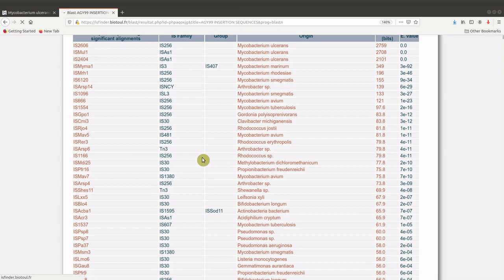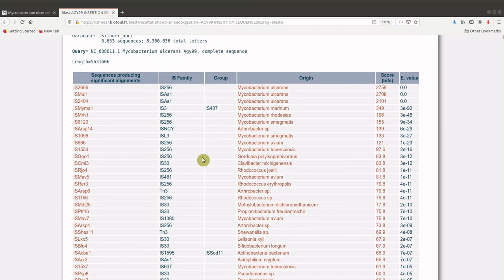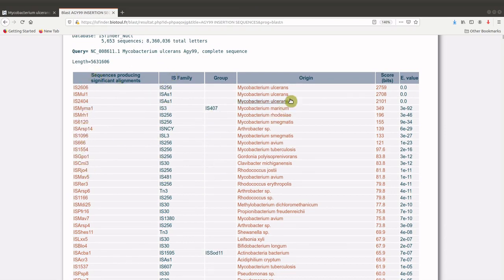It's important for you to know that in order to get the relevant results, you should already have information about the organism you are dealing with. In this example, I'm using the Mycobacterium ulcerans data, and we will use that to help us identify the right insertion sequences. The header displayed has the name of the insertion sequence, the family, the group, and then the origin, where origin indicates the organism that it can be found in.